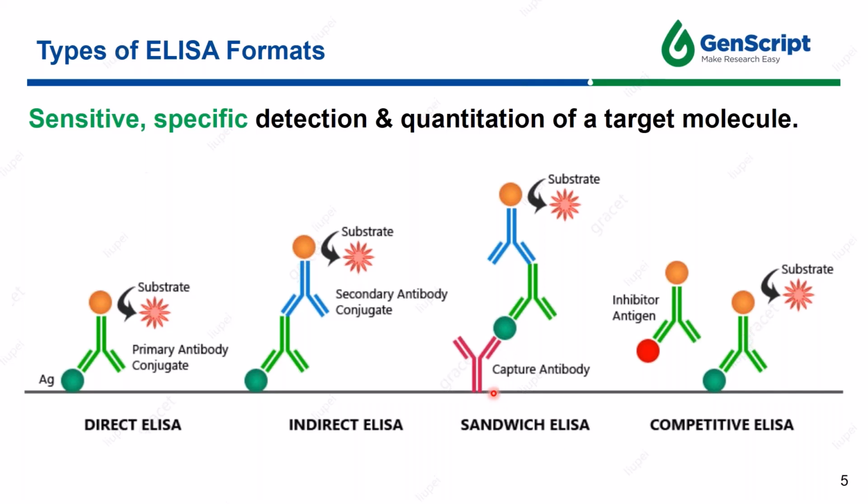First, if a standardized ELISA kit or tested antibody pair is not available, antibody optimization has to be worked out since it's important to reduce reactivity between capture and detection antibodies.